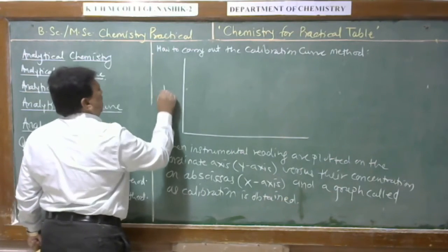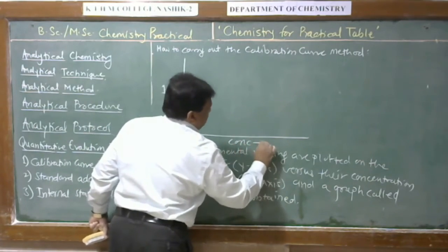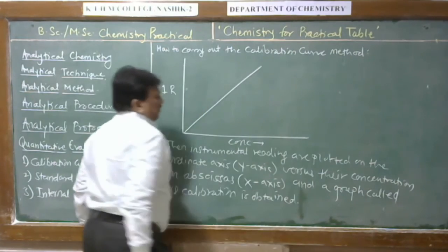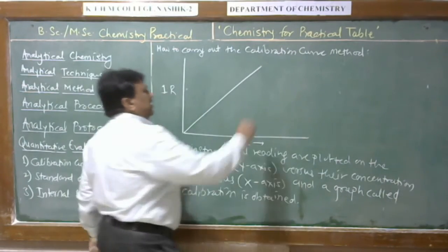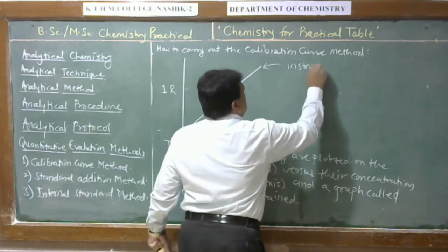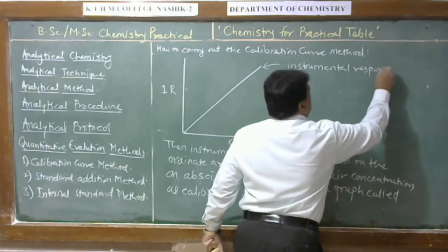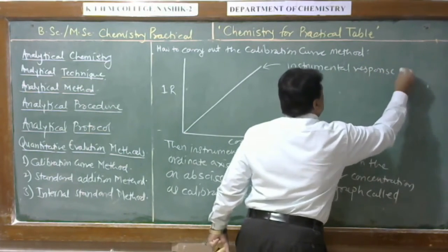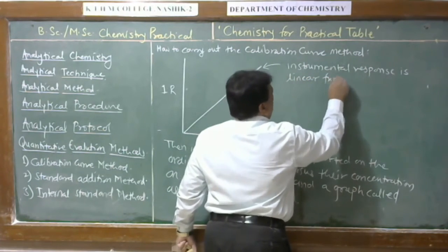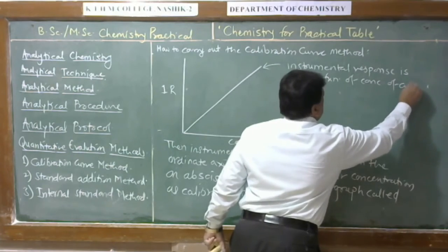Therefore, here instrumental reading versus concentration. If we have a straight line passing through the origin, then we can say that instrumental response is a linear function of concentration of analyte.